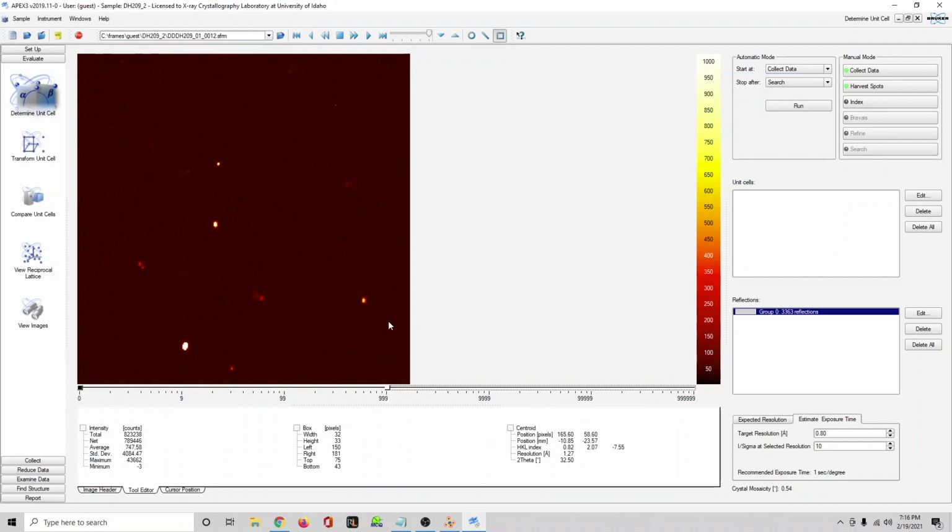It could indicate that you can have absorption problems, but really I don't think it's going to be an issue with the sample. And in fact, it actually really improves our resolution in the long run because our reflections represent our Fourier components of the electron density map. So if we can detect higher angle reflections, those contribute to finer periodicities in the electron density map. Low angle reflections give the general idea of the structure, so they're very important for that. But high angle reflections make it possible to resolve detail, basically.